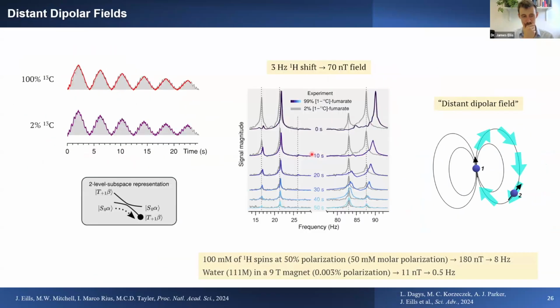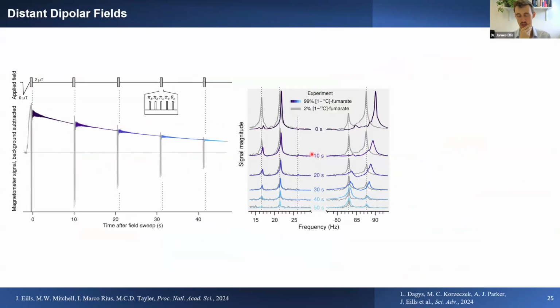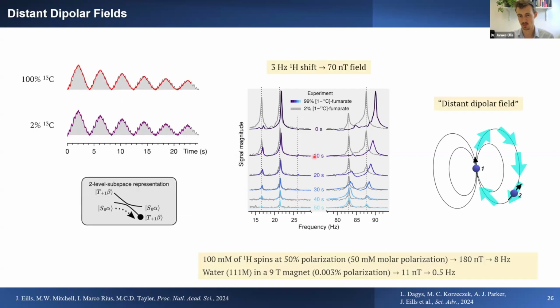So what's the biggest change when the internal interaction shifts from J interaction to dipole-dipole? Okay, so this is something I didn't have time to go through. But this dipole-dipole interaction is the idea that we polarize the spins in the sample. And if all of our spins are highly polarized, then they create a magnetic field. That magnetic field is what we're detecting in the coil in any NMR experiment.